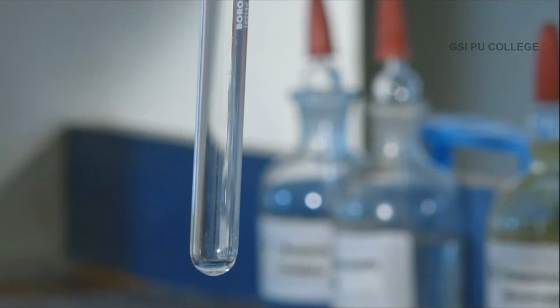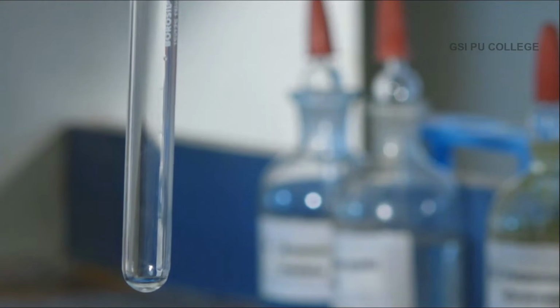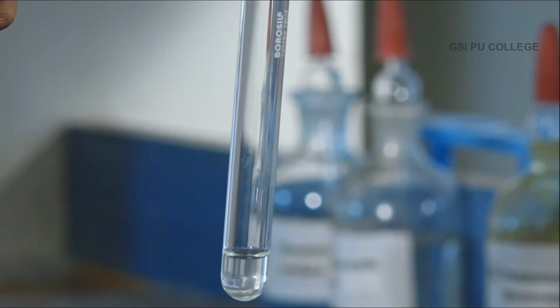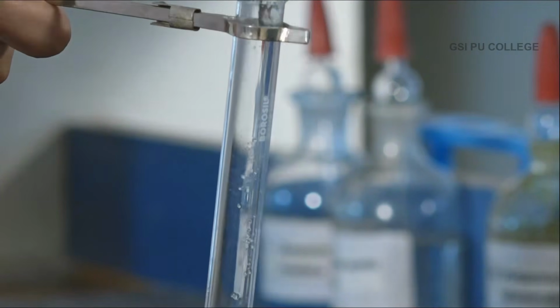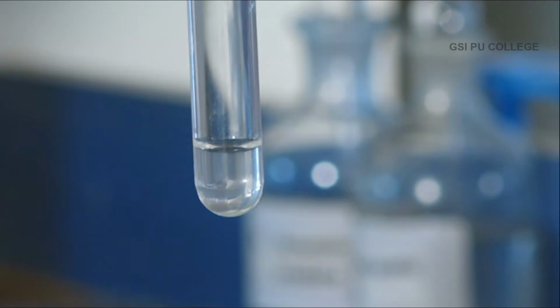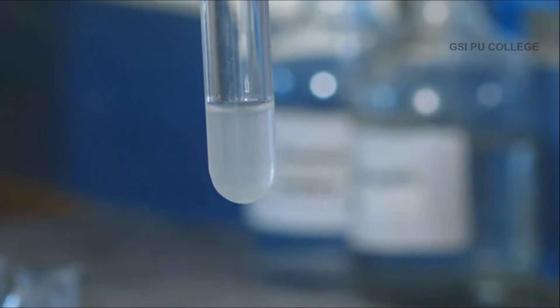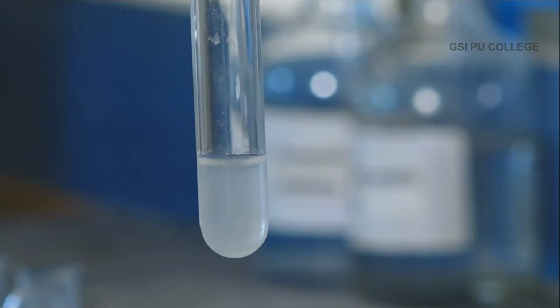So, test for the fifth group basic radical. Decant a small amount of original solution, to which add a small pinch of ammonium chloride salt. Now, the ammonium chloride salt which I have added is completely solubilized. Now, I have to add ammonium hydroxide, shake it. Now, add ammonium carbonate and observe carefully whether a precipitate appears.